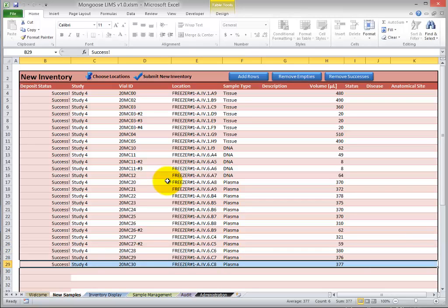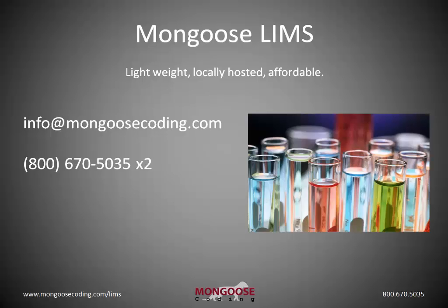So there, looks like we were successful. So you can see with the duplicate vial IDs, we have multiple child suffixes now. So here's child number two, child number three, child number four. And that wraps up adding new inventory.